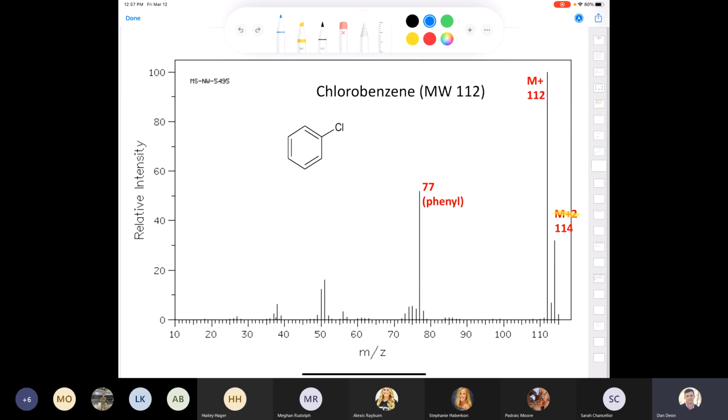So let's say you only knew the molecular ion. What would you say? And you'd say, okay, it's got chlorine. What I would do is this: I'd get out my calculator, okay, to make sure I don't make any mistakes doing a back of a napkin calculation, right? If I said you've got $112, then you're going to remove $35. How much do you have left over? So you take 112, subtract 35, and you end up with 77.